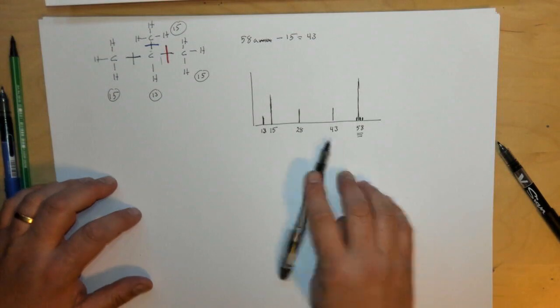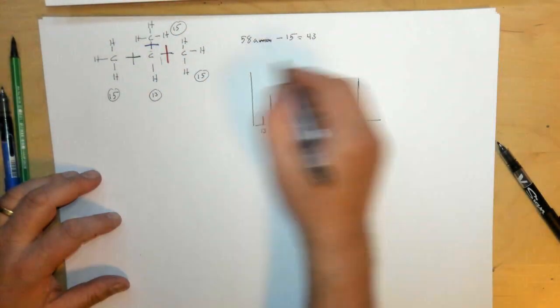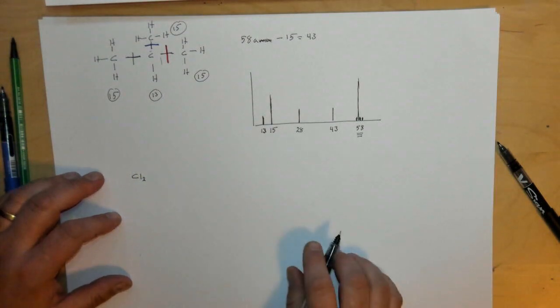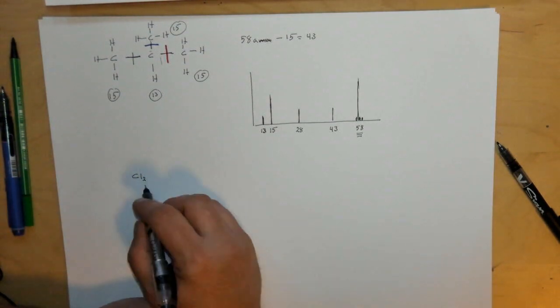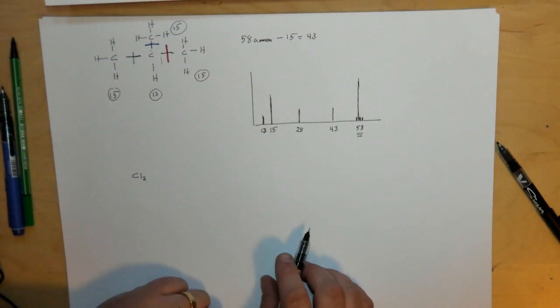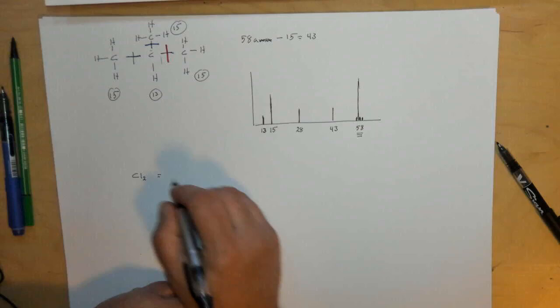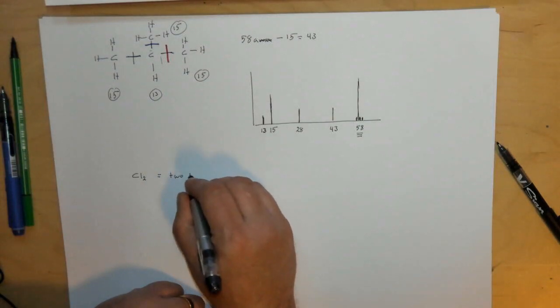Now, let's look at another example. So this is an example where you look at the molecular structure. A mass spec can also be used to determine the isotopic ratios. We're going to look at chlorine, and I'm not going to do the isotopic ratios. I'm going to also backwards engineer this problem. So I know, and I'm going to tell you now, that chlorine has two isotopes.